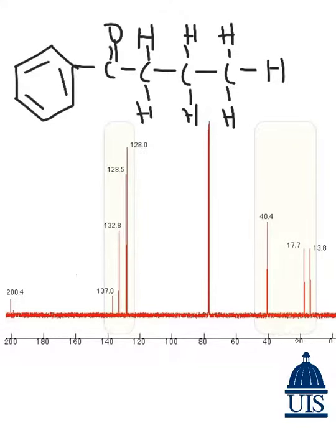And this brings us to our last section of analysis, which is carbon-13 NMR. From the get-go, we can see here that we're going to have 8 different carbon environments signified by the 8 different peaks in our spectra. Now, as we could see on our carbon-13 NMR shift table, the most downfield shifted, which is right here, is going to be our ketone.